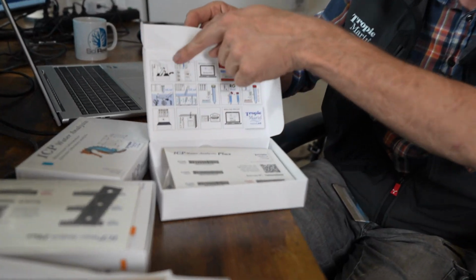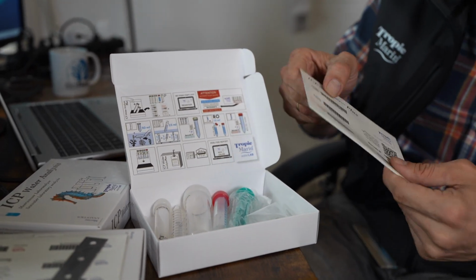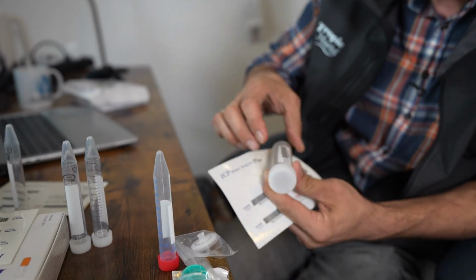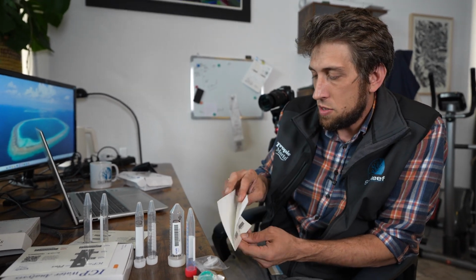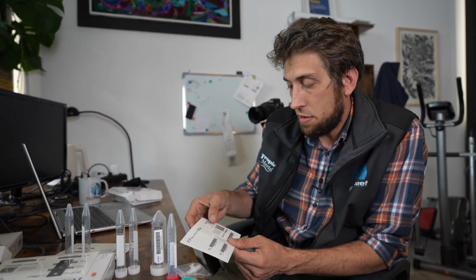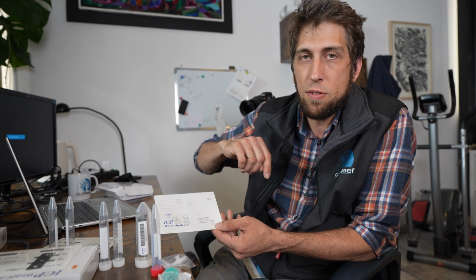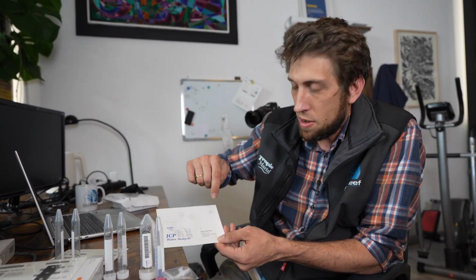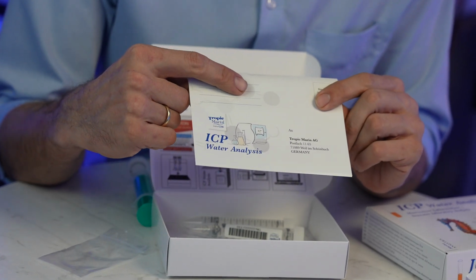Inside the box we have a detailed description how to take the samples. It's also in the other video. You take the water samples as described. Actually, you can take the stickers and put them on the sample tube, right? And this will be then scanned at the lab. So once you have prepared everything according to the description, you put them in an envelope or in that beautiful box. There is the address sticker. And please don't forget to fill in your name and address, so in case something happens, it can be sent back. And even more importantly, don't forget to put on the right postage, so it will actually find its way to the Tropic Marin water testing lab.